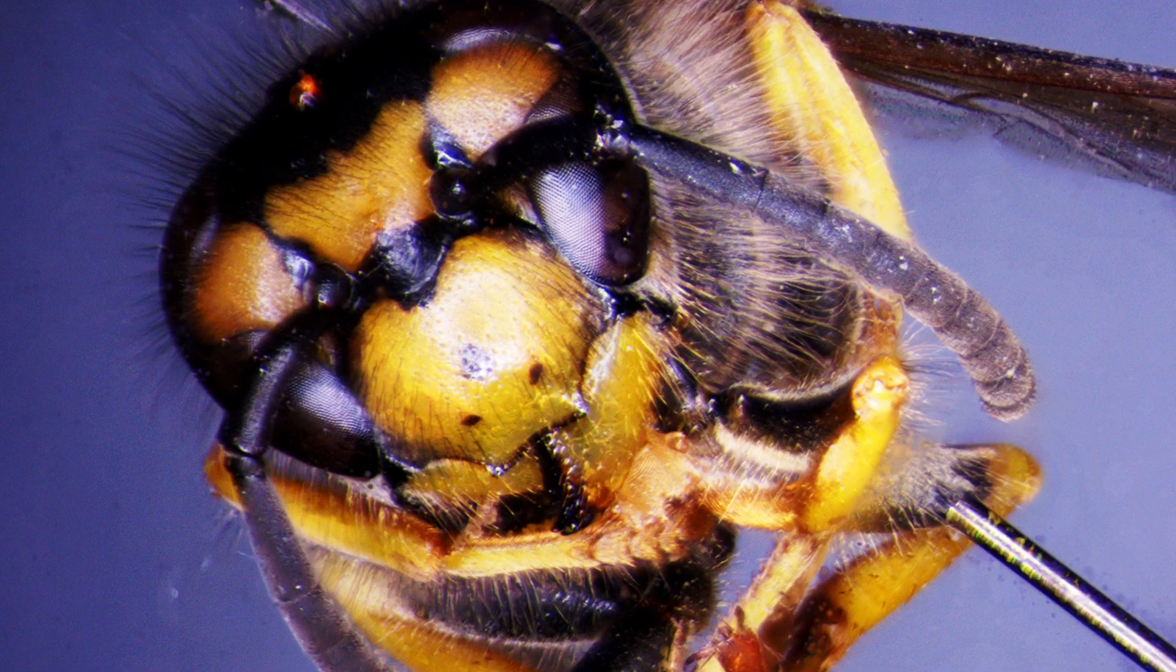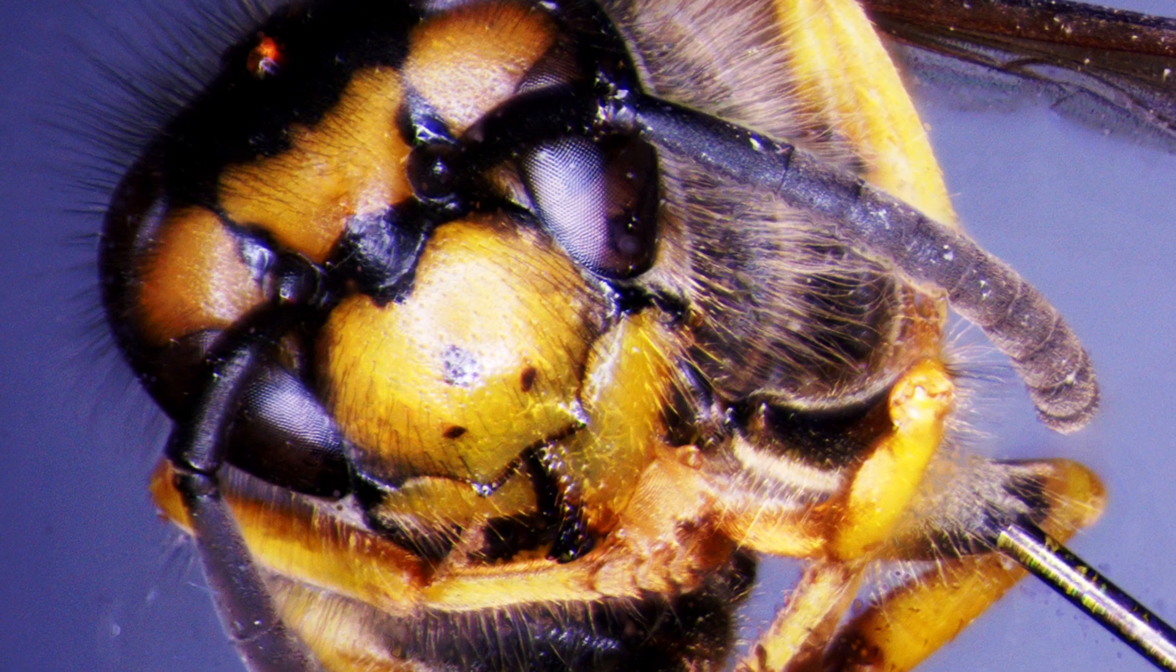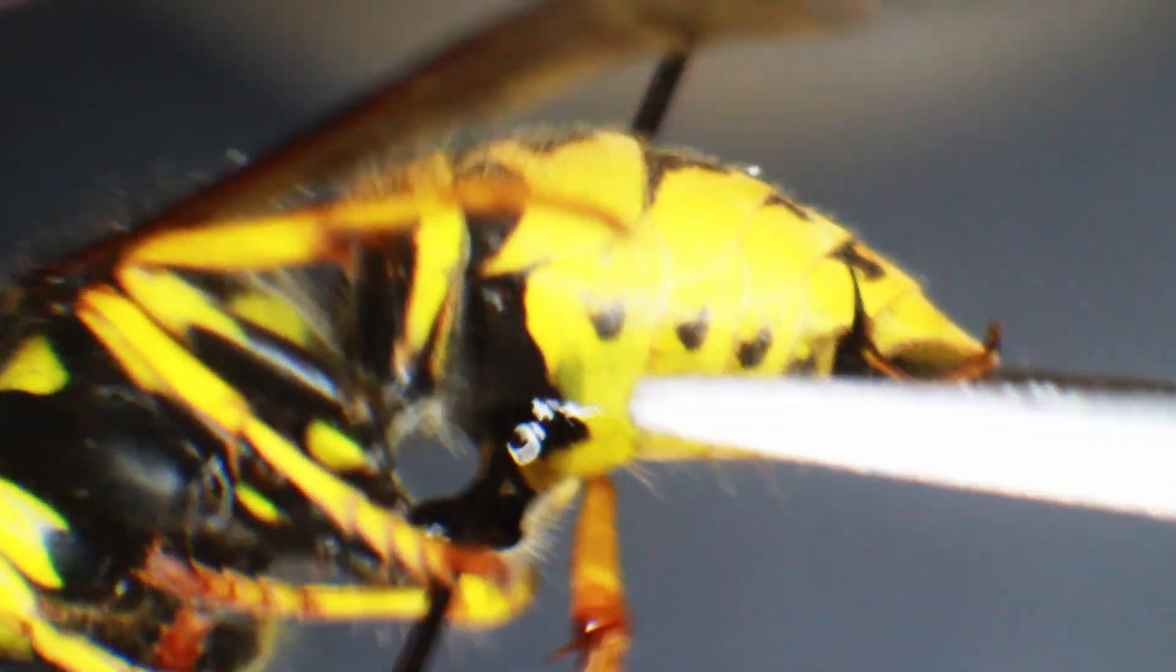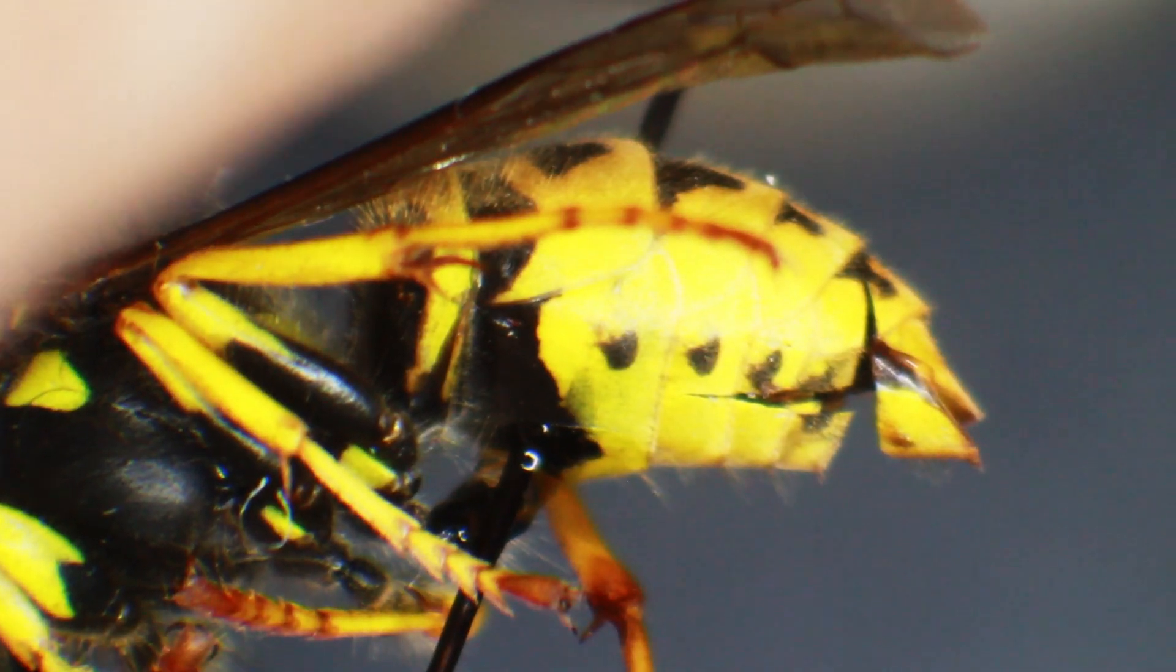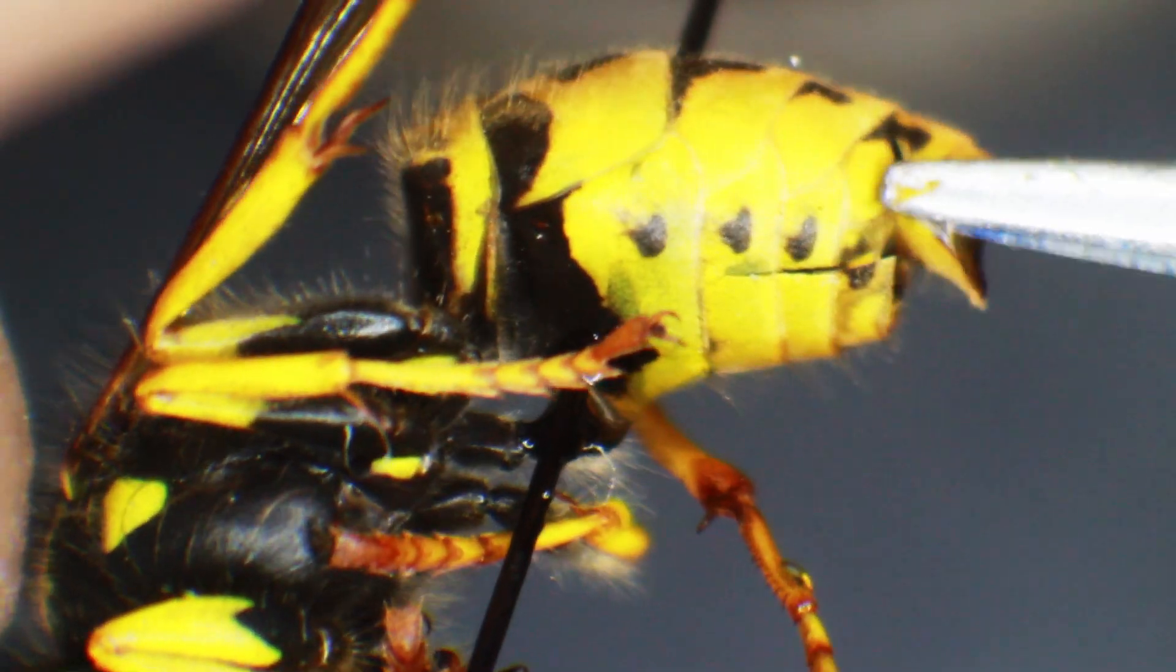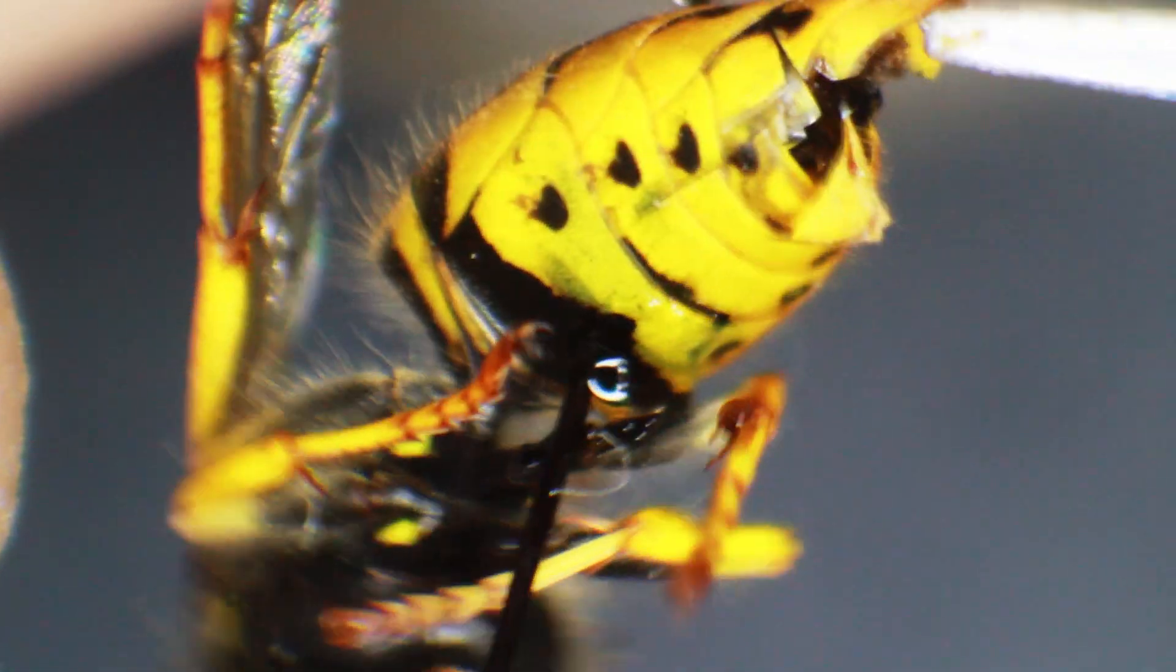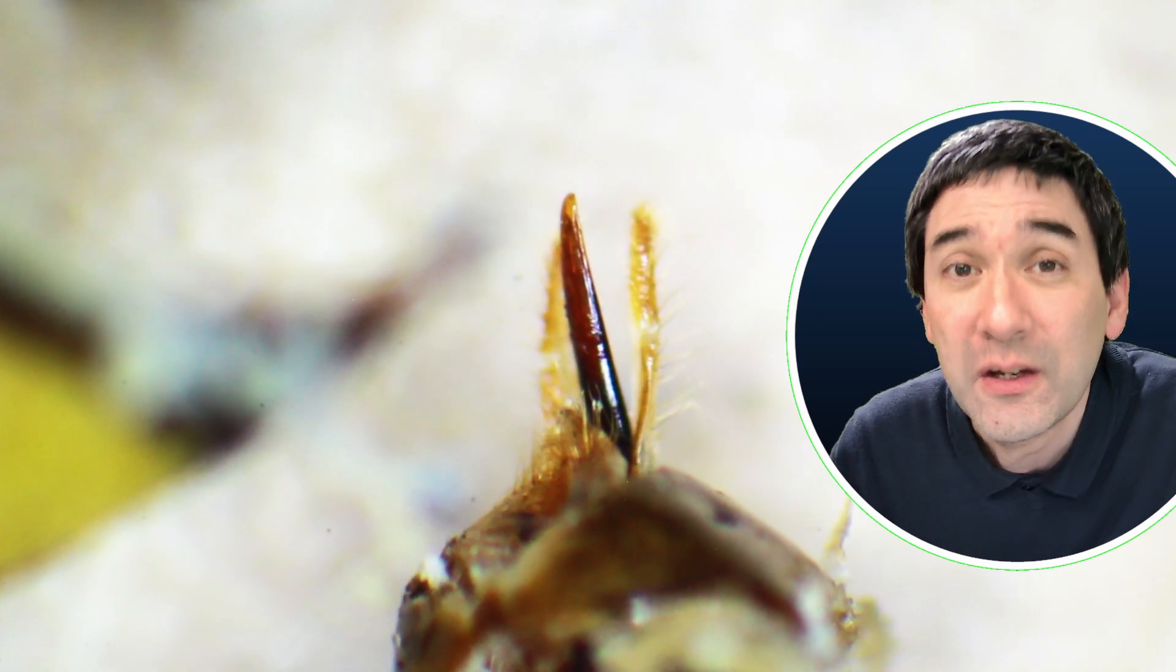What I did is I found a dead wasp on my balcony, so no animals were harmed in the making of this video. I used my dissecting tools to cut it apart, and under my stereo microscope I was able to extract the stinger. This was actually not so easy and it was quite small, but if you put it under the microscope, you're able to see that the stinger is very smooth.